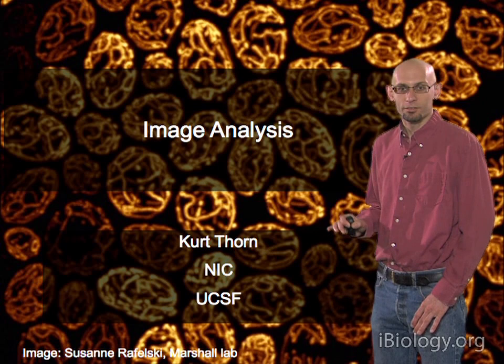Here's another example of this where we've got a little more complicated image. So we've got this image here. And again, we want to use the simple 3x3 smoothing filter on it. And here's what the digital values in that image are. You can see there's these values here that are 113, which correspond to this gray line here. And then these values that are 255, which correspond to the white diagonal line there. And we're going to put the filtered values over here.